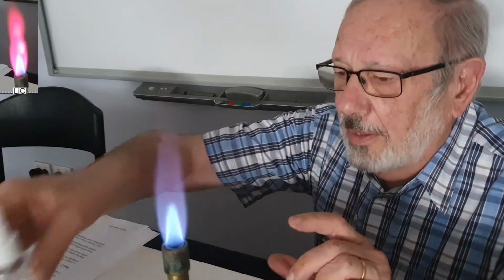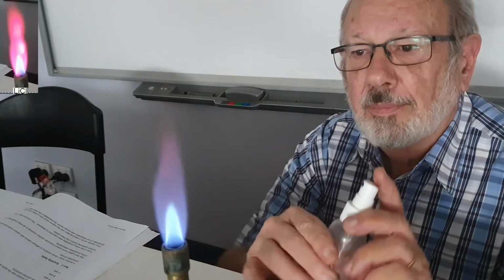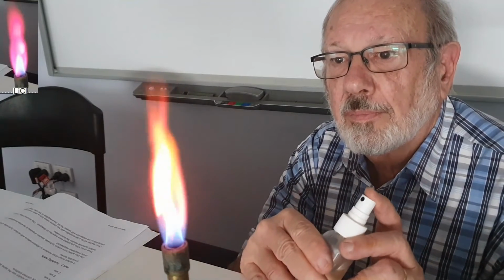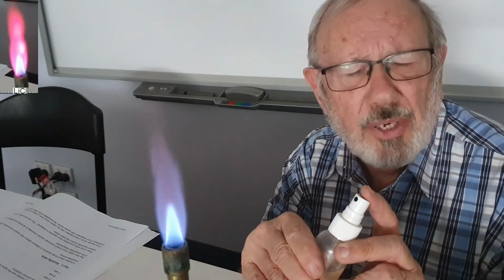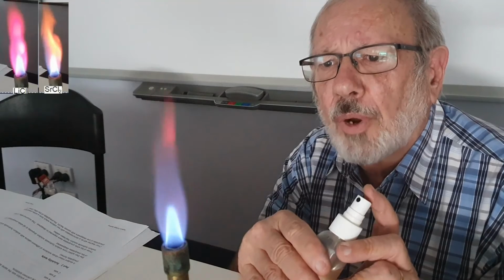So the next one is strontium chloride. I would describe that as bright orange.